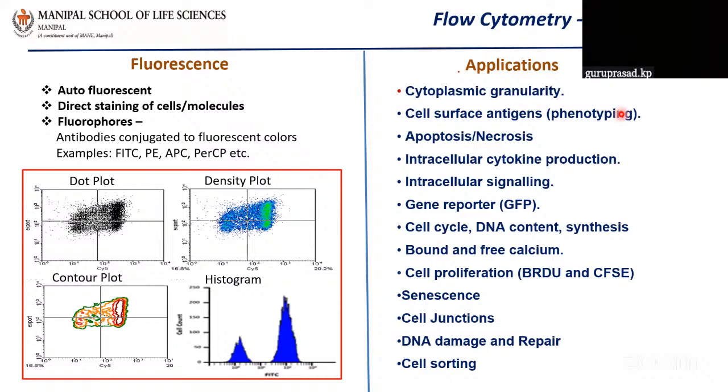But in this flow cytometer, you can add maybe 20 antibodies with 20 different colors, and you can identify the presence or absence of those antibodies in the cells. That is the first thing. Second, as they are present, you can say that this cell is this type. For example, T lymphocytes have markers on the surface such as CD3, CD4, CD7, CD2, and so on.